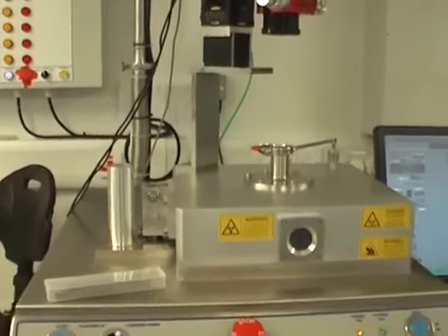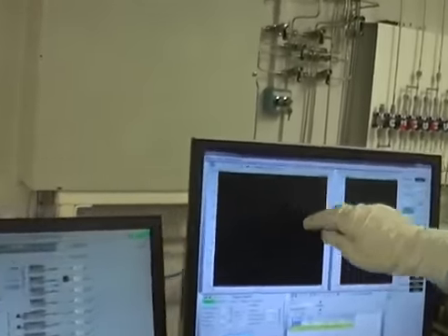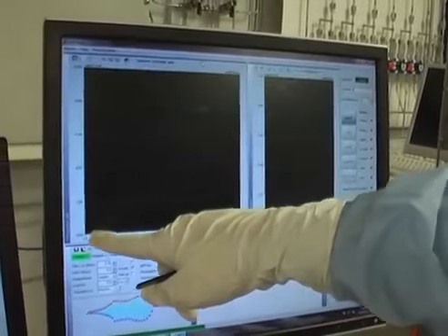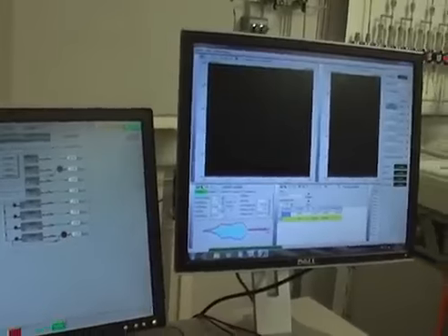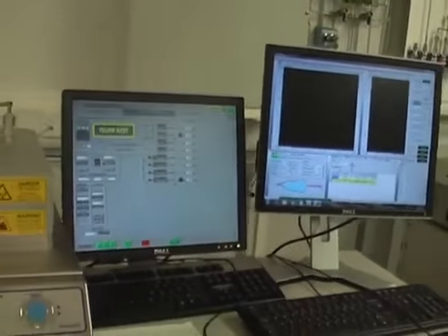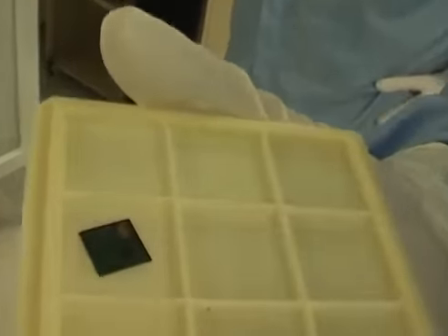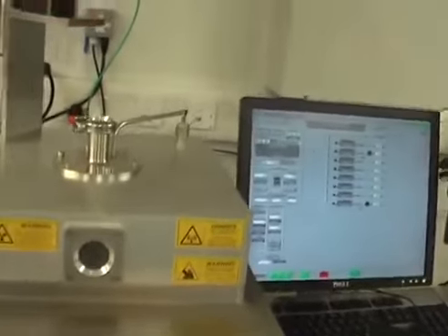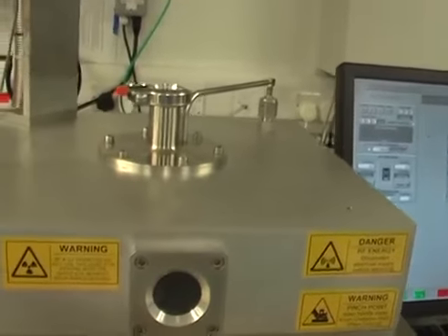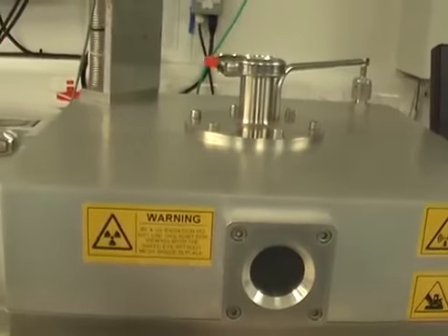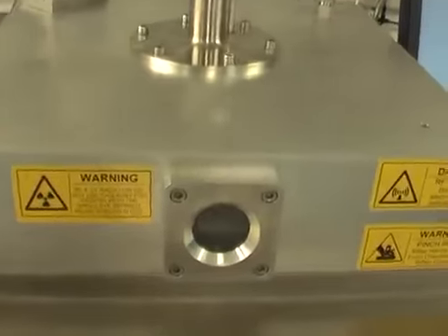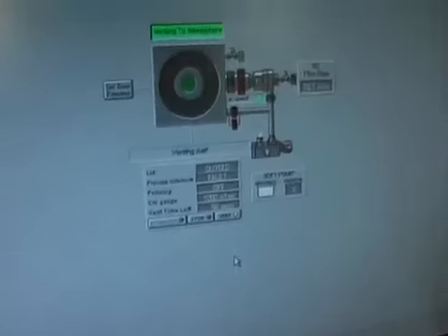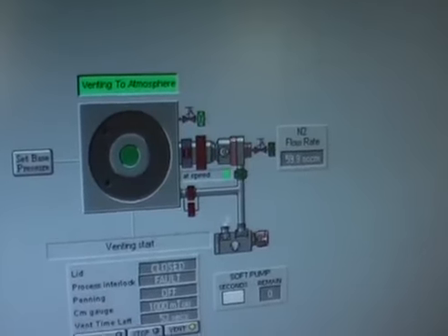We use the interferometer signal to monitor the etching process and determine when to stop. This is the monitor where we will see the output signal reflected from the surface of our sample. We will load our sample — a 10 by 10 millimeter square of indium phosphide with polyimide on the surface. We will dry-etch the polyimide and use the interferometer signal to determine when to stop at the surface. The chamber is kept under vacuum, so we are now venting it so we can load our sample, and then we will pump it down again before starting the dry-etch run.